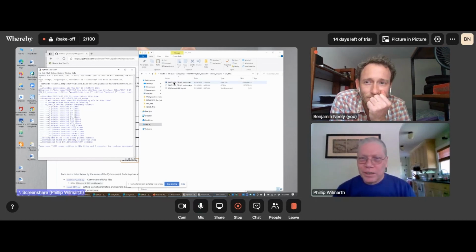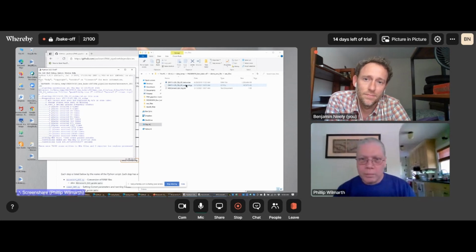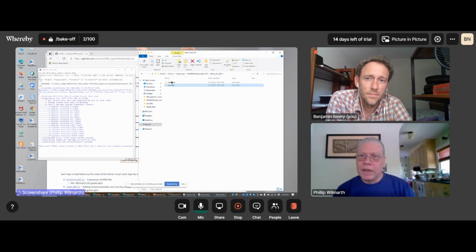Our conversion is finished. So we make this text file from MSConvert. It looks a lot like an mzML file without the XML tags, and we write it as a gzipped file to save some space, and it's quite a bit smaller than the original raw file because it just has the MS2 scans in it. If we go up one level, we see now that we have an MSN files folder that's been created, and there's our MS2 file.